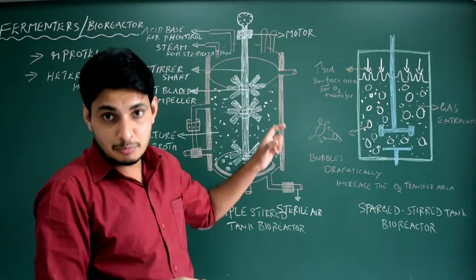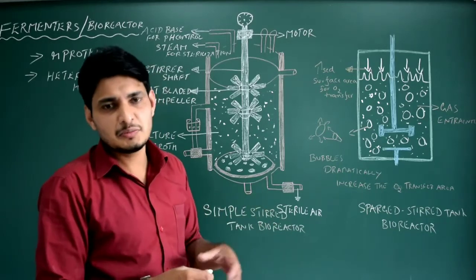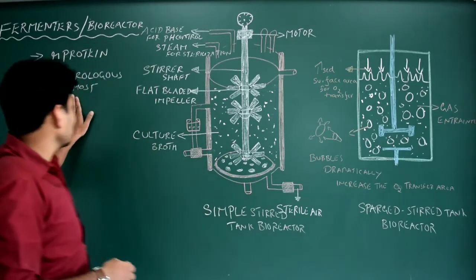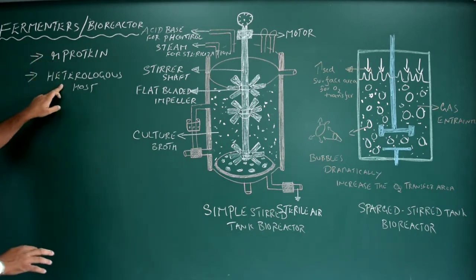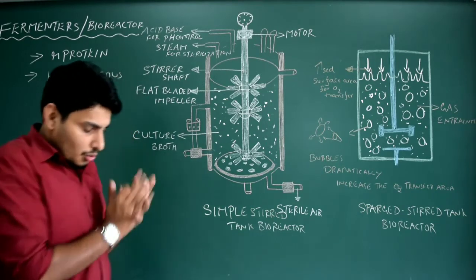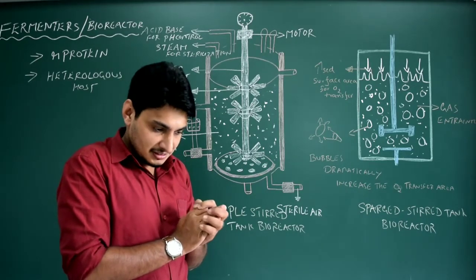Majority of the time here we prefer Escherichia coli. There are so many features exhibited by E. coli, and that's the reason why it is a very good heterologous host. Understood, fine. So to produce R protein we need a heterologous host. Now, as I said, I am discussing the seventh important step of rDNA technology.